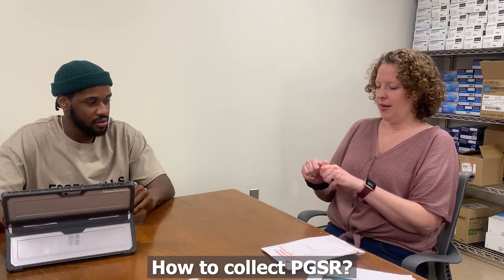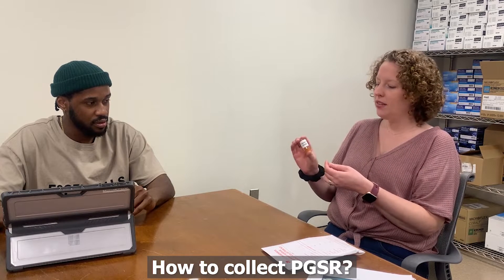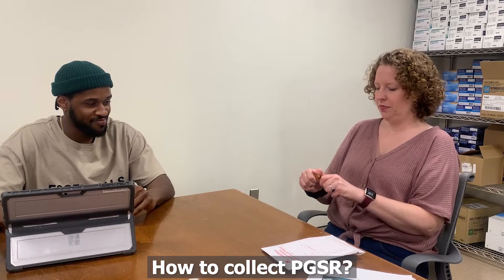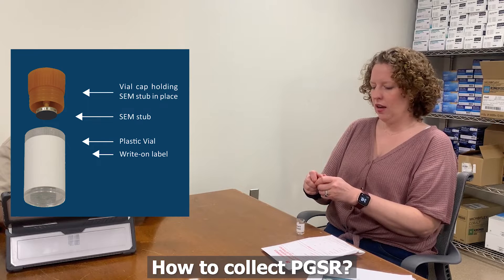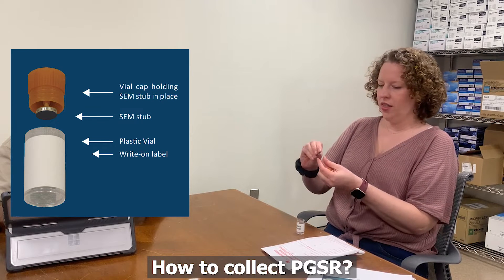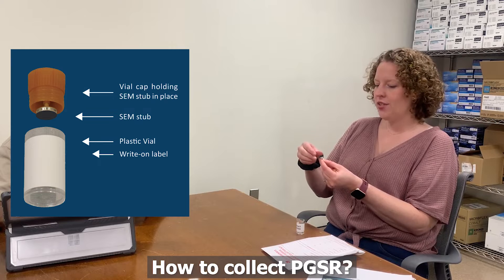Basically we would have a stub — if we were going to collect from a potential shooter, we would have a stub for the right hand and a stub for the left hand. This is just the container that you hold it in, but when I open up the container it's basically this little thumbtack. This is what goes into our instrument, and the top of the thumbtack has this carbon tape — so it's a black sticky surface.